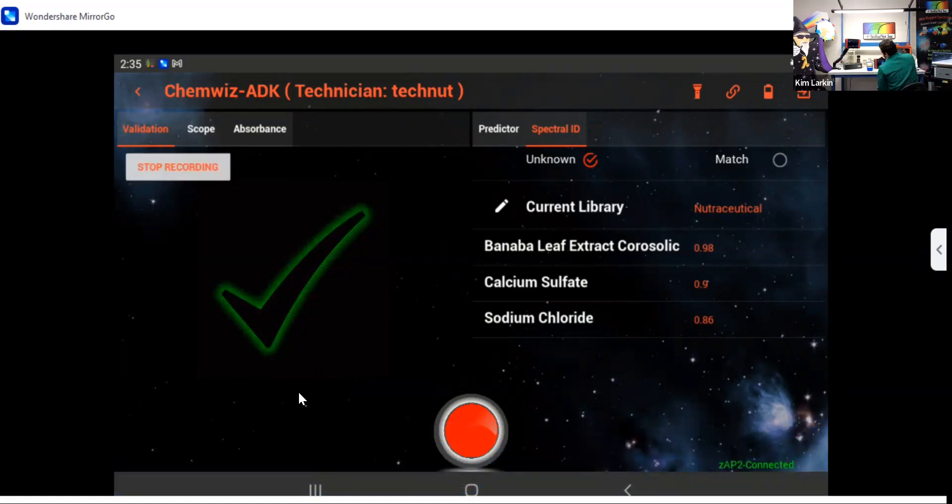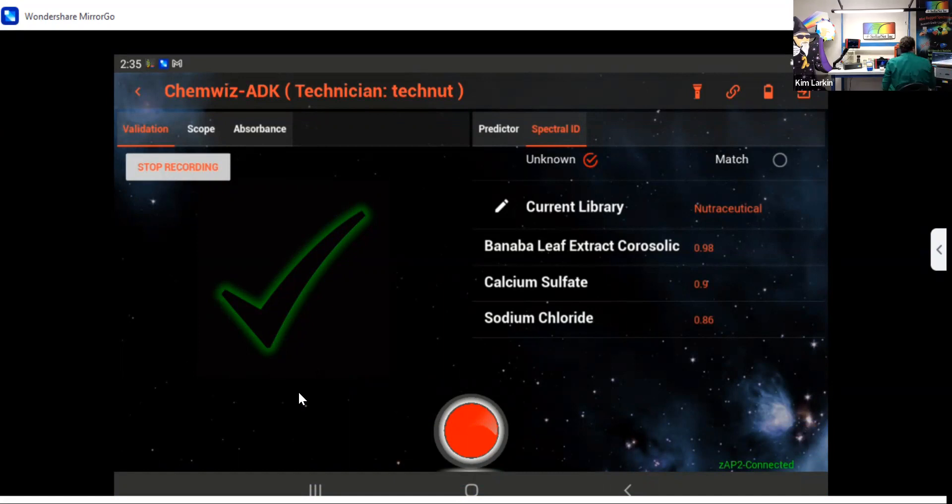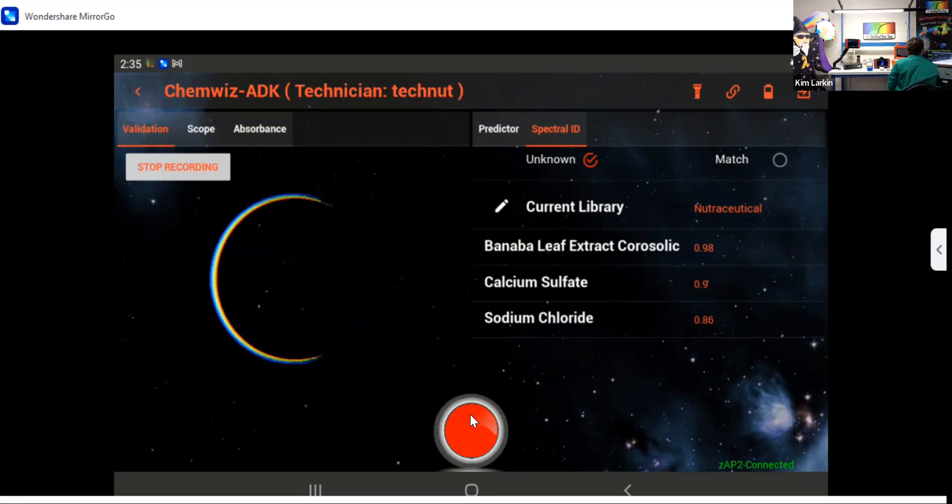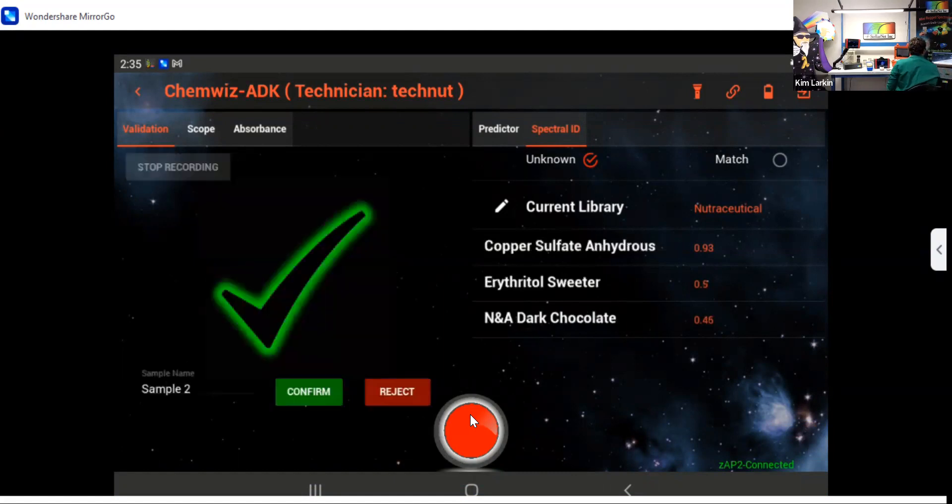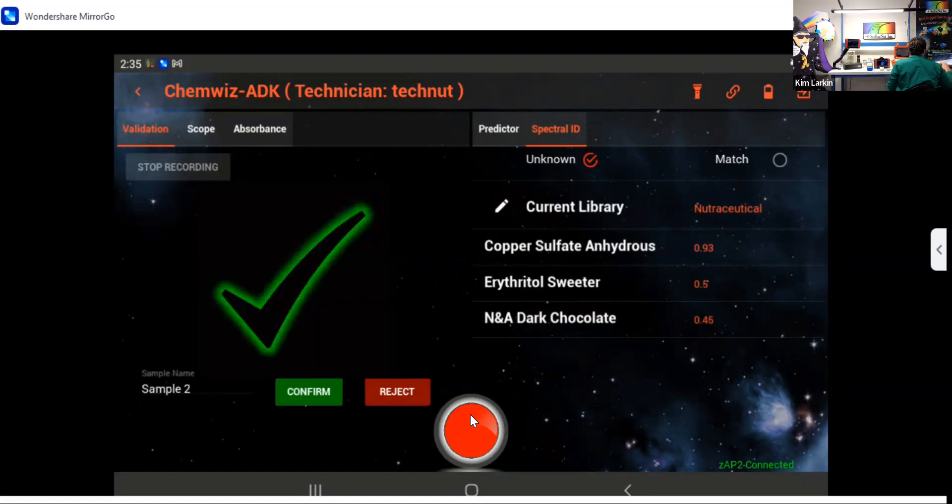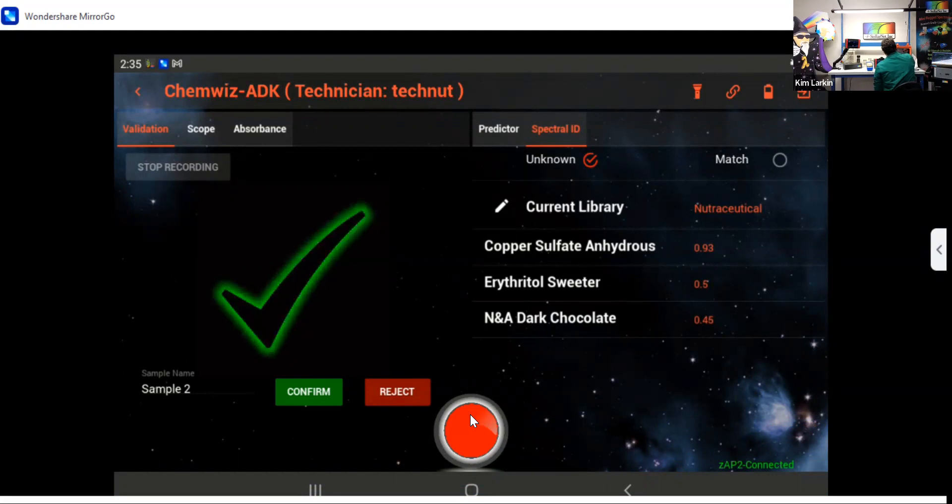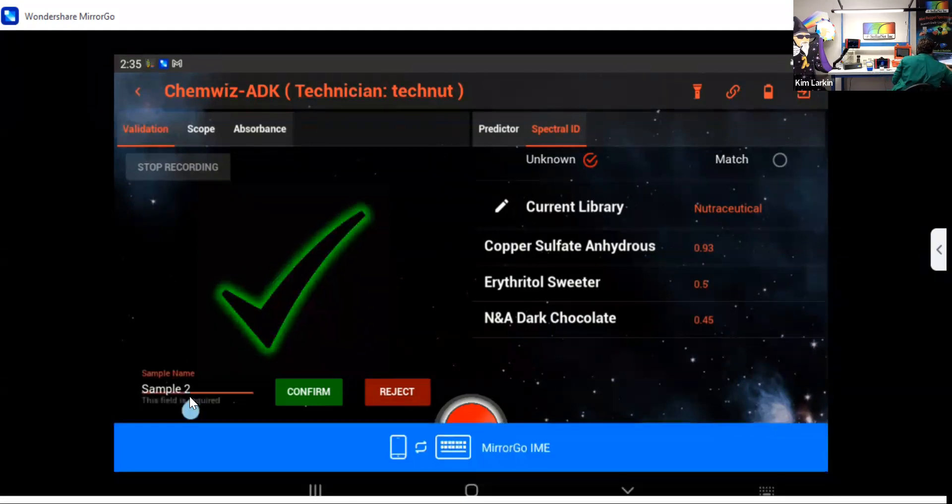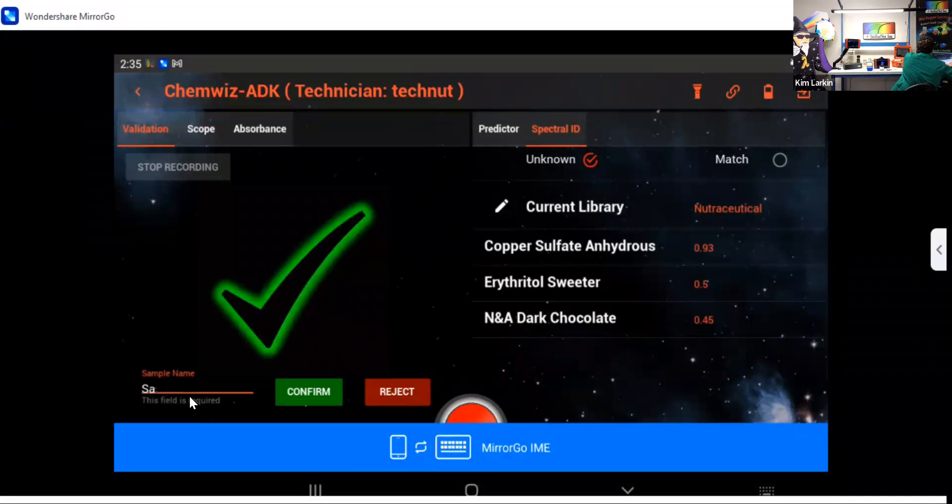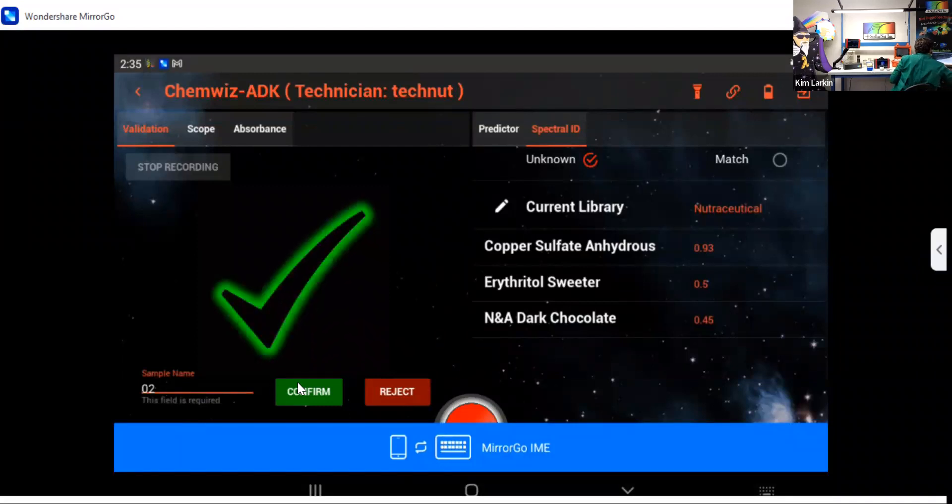The next one I'm going to measure is copper sulfate. Okay. I've placed it on the fixture and I'm going to press measure. Okay, there is my copper sulfate and it's a match. So I'm going to give it 02 and confirm.